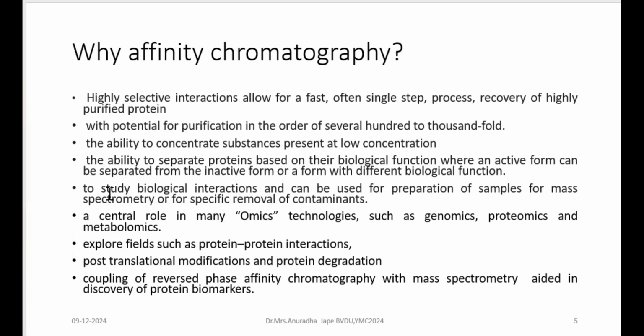Or maybe certain electrolytes in your body fluids are in very low amounts, millimole quantities. When you want to analyze such things, or maybe a particular kind of mRNA to be purified from the total pool of RNAs, how will you go? So volume is high and analyte concentration is low. You have to concentrate that analyte so that you can further utilize it for assays.